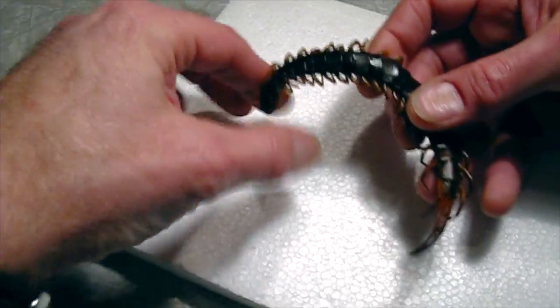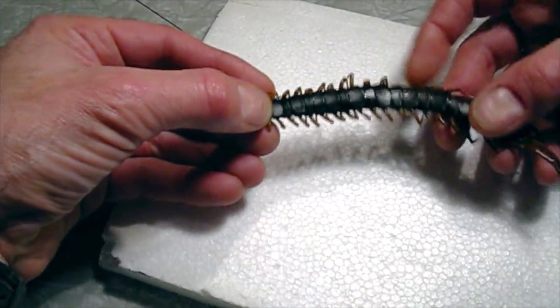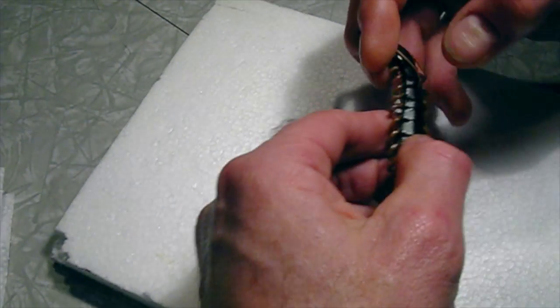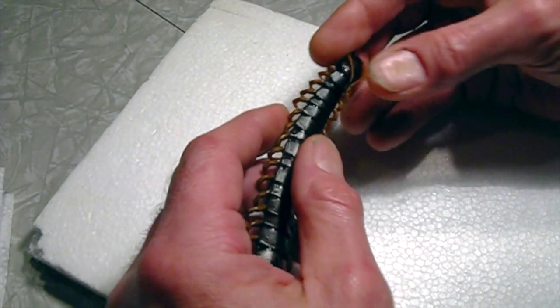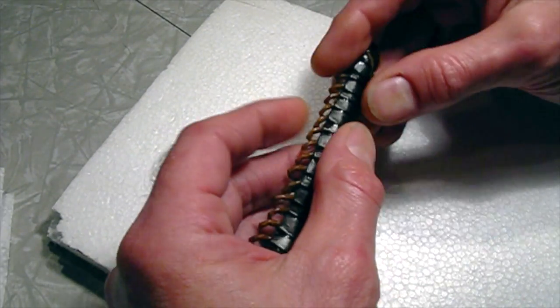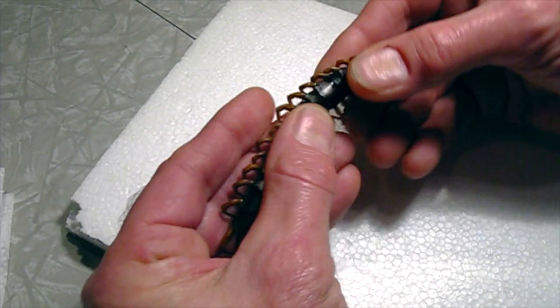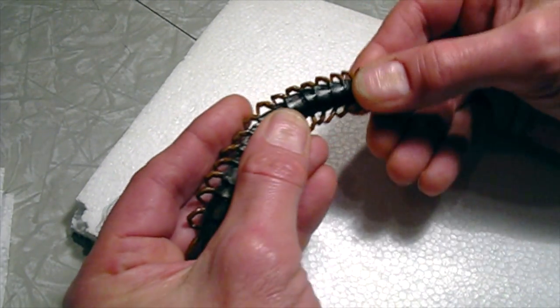Alright, got a piece of styrofoam to spread it on. You can see this thing's a bit curled, so I'm going to manipulate it a bit to try and straighten it out. Just put some tension on it to try and get it more straight.